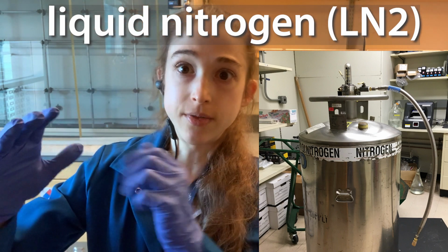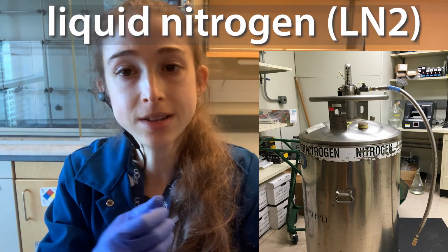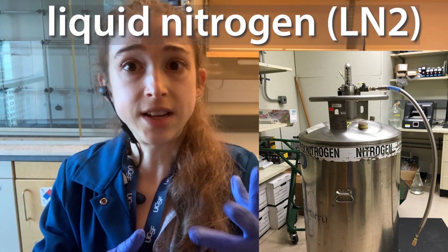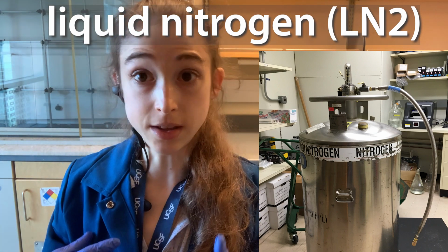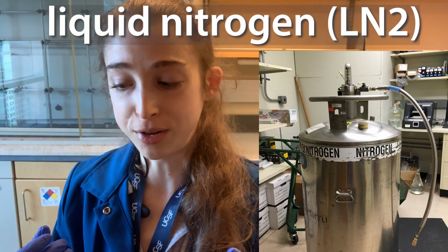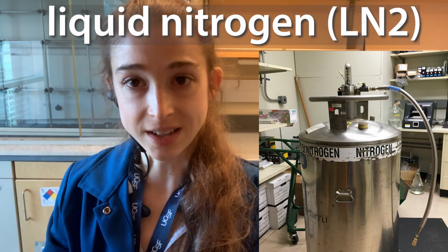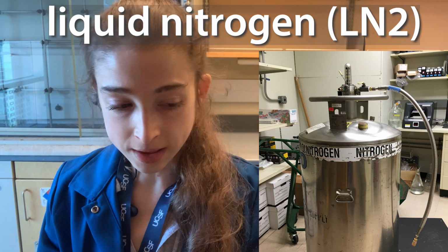So then the concentrations of everything else get messed up in the other parts, and the concentration in the water part is just water. And that's not good. The ice crystals can also mess up the protein if they're forming inside of it. So there are problems that can come if water freezes when you're trying to freeze everything consistently. And so we can snap freeze, and liquid nitrogen is really helpful for that.